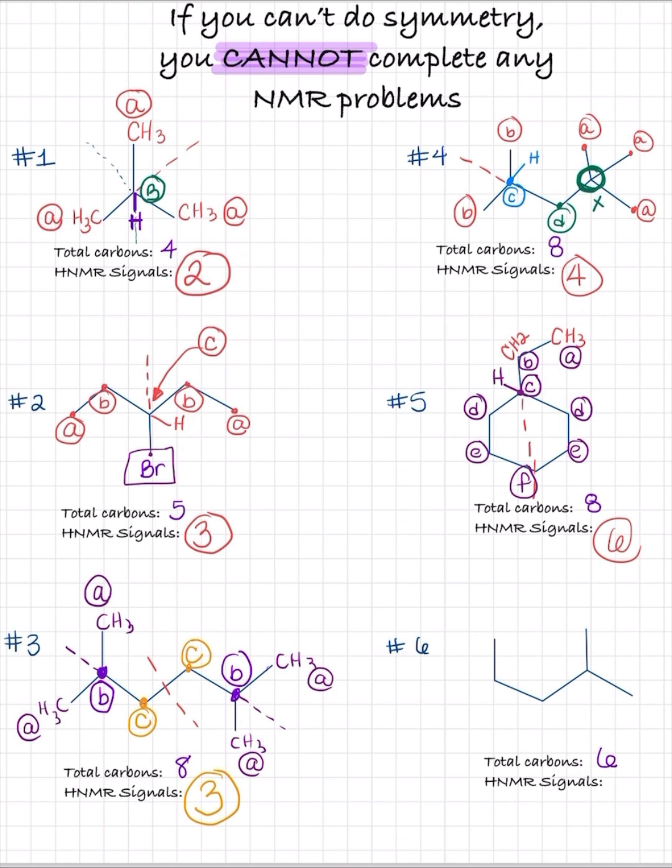Moving forward. Now on the next one, let's go through it again. I see a line of symmetry here. This is a methyl. Even though this is a methyl on the end, if I put this line here and say, oh, these methyls are potentially the same, they can't be, because why? Look at the left and look at the right.